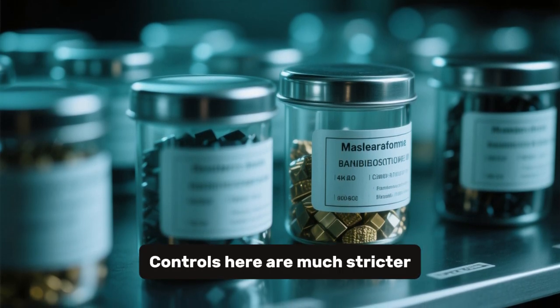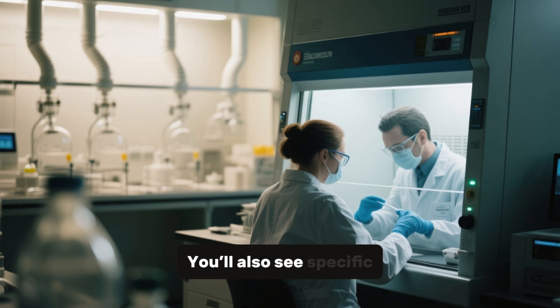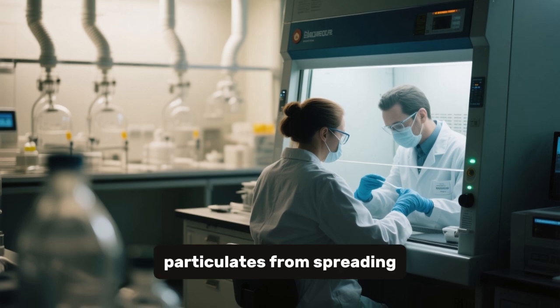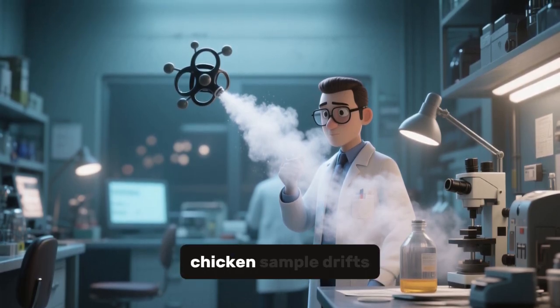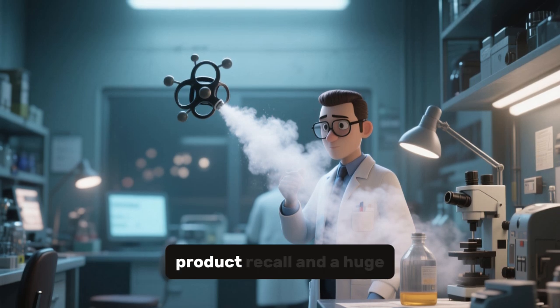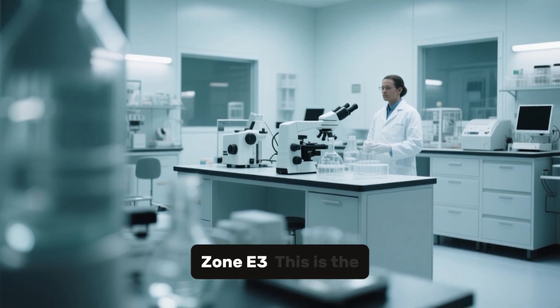Controls here are much stricter. You'll need dedicated personal protective equipment, like different lab coats or gloves for this zone. You'll also see specific biosafety cabinets, fume hoods, and rigorous cleaning procedures to prevent aerosols and particulates from spreading. If you mess up here, say, a tiny aerosol from blending that raw chicken sample drifts over to your prepared sample area, you risk creating a false positive, leading to an unnecessary product recall and a huge headache for your client.